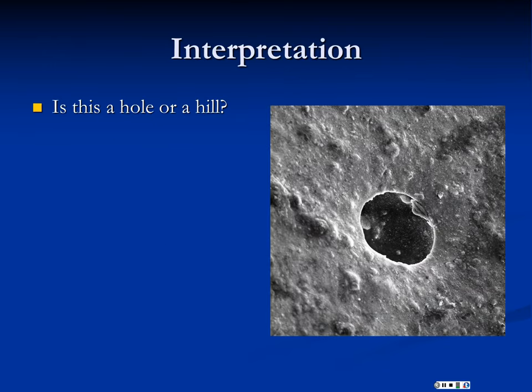So can you tell me, or tell yourself, is this a hole or a hill? Pause the video, sort it out, decide what you think it is, and then restart. All right, you should have said this is a hole.